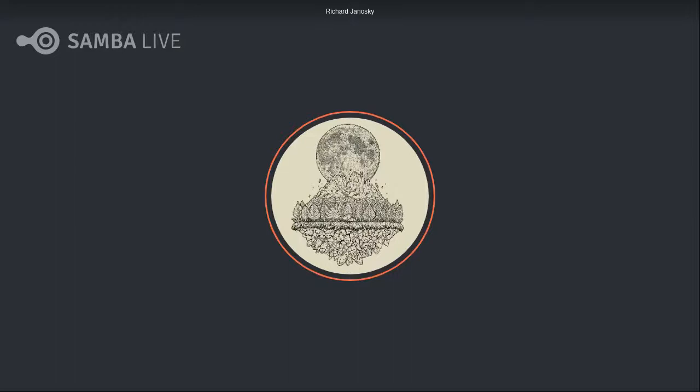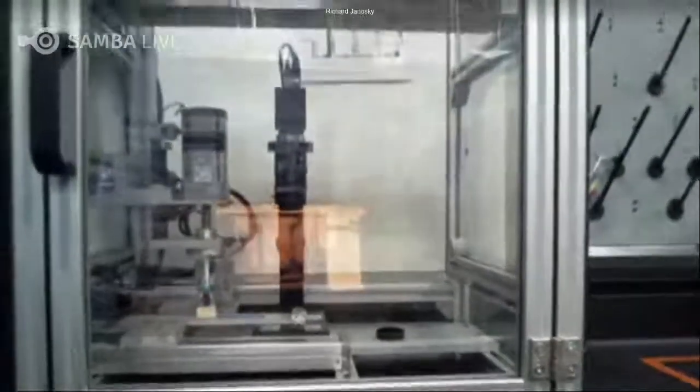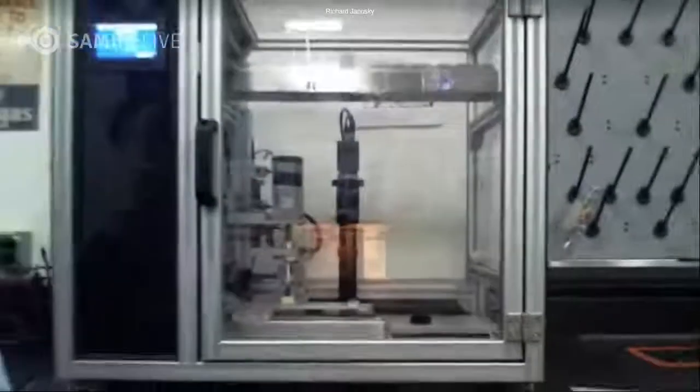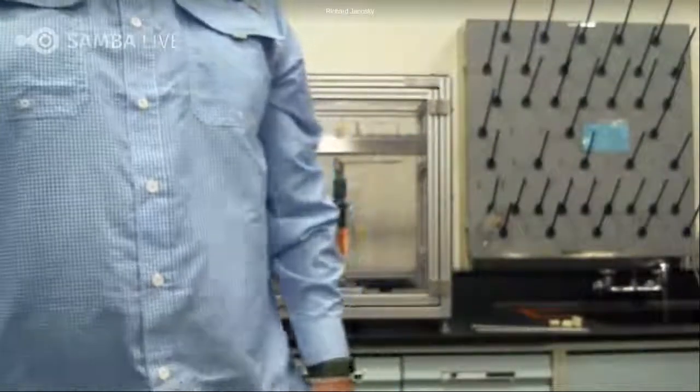Yes, next week we're going to be doing particle counting for the Grease Thief. That is the black camera that's right there next to the grease as it extrudes out. So if you're interested in finding out the value of grease particle counting and what it can do for you, come on back next week to hear about that.